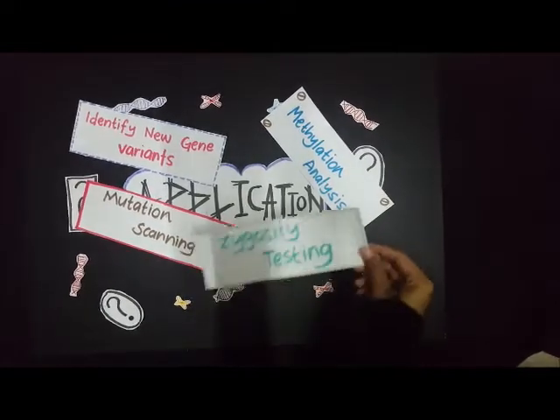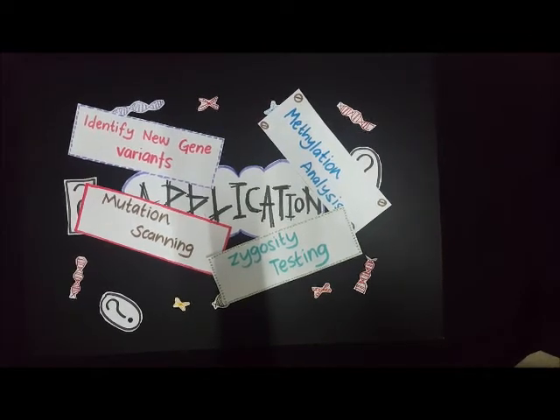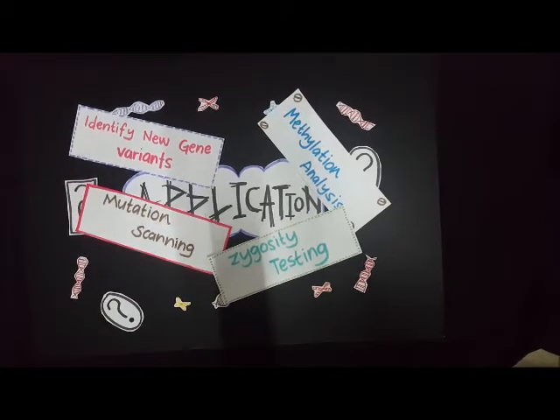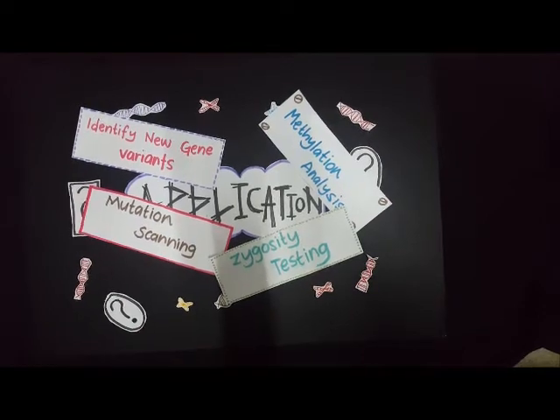The fourth one is zygosity testing. The higher resolution element not only allows the determination of homo and heterozygosity, it also resolves information about the type of homo and heterozygosity, with different gene variants giving rise to different melt curve shapes.